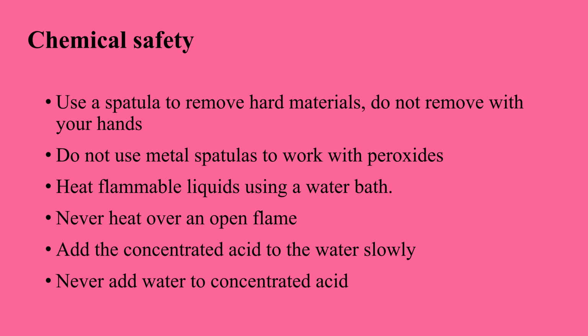For heating flammable liquids, you should prefer using a water bath. Never use open flame. And general information from school: concentrated acid is added to water slowly, but not vice versa.